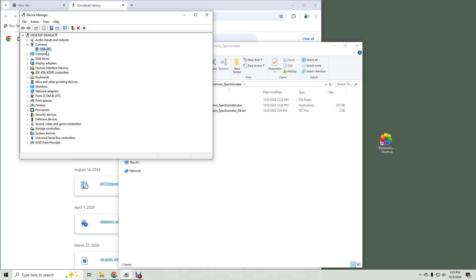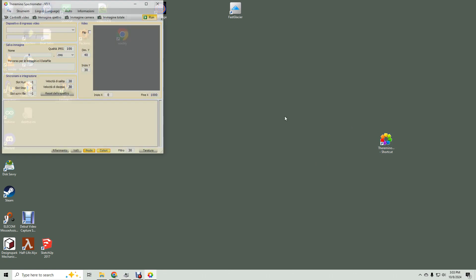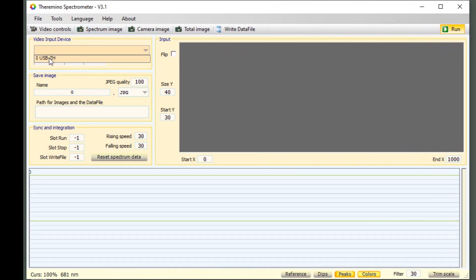Let's show only the desktop with Windows key+D, then start Theramino by double-clicking it. First, change the video input device to the spectrometer camera. On my laptop, it also showed the built-in laptop camera. Then click the 'Video Controls' button.